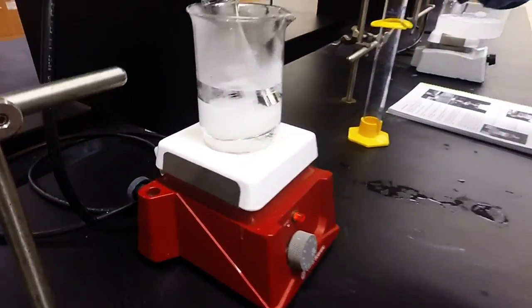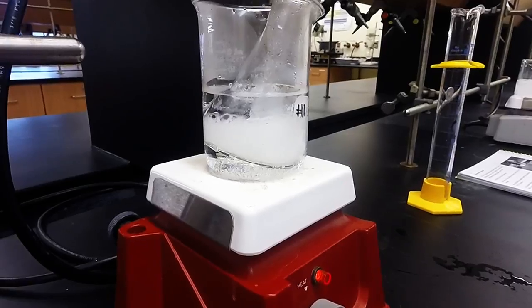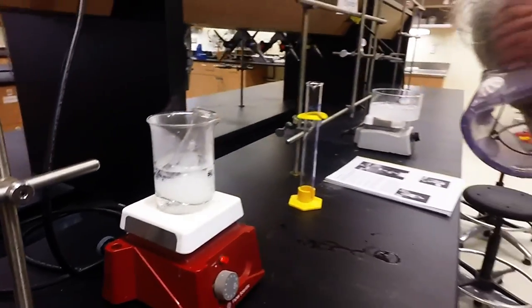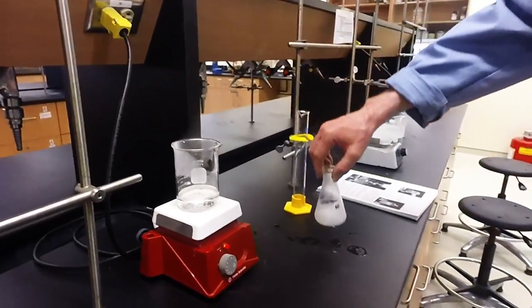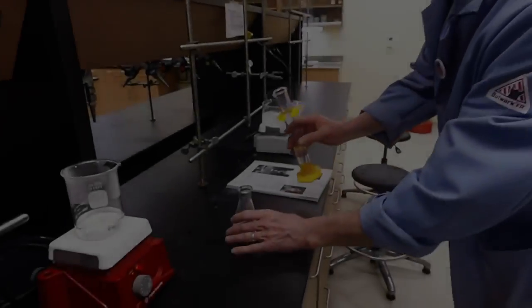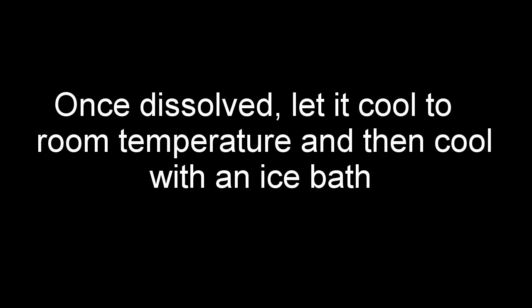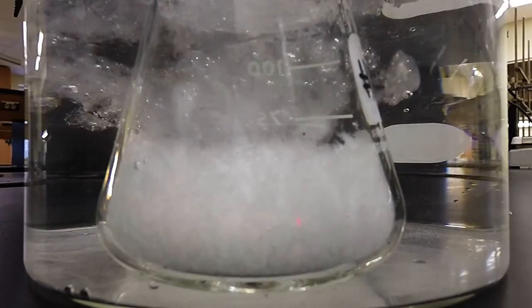But hopefully, this will now completely dissolve and then we'll be able to cool it and get nice crystals to filter. So, see how that's boiling like mad? Normally, if you had enough solvent, the solid would have dissolved by now. It's boiling. It's not dissolving. Guess what? You need more solvent.